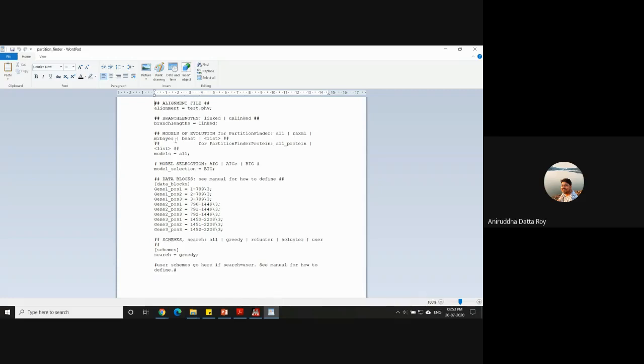Similarly, MrBayes also, without any kind of tweaking, you can actually fit in only 5 different kinds of models. MrBayes and BEAST, you can fit in 5 different kinds of models, right? So here I've put all of them, and this is how your best model gets selected.